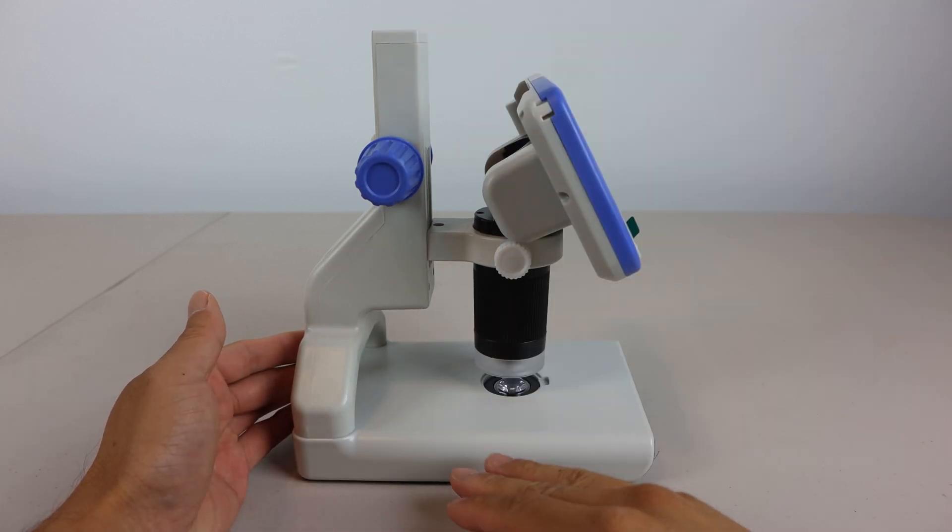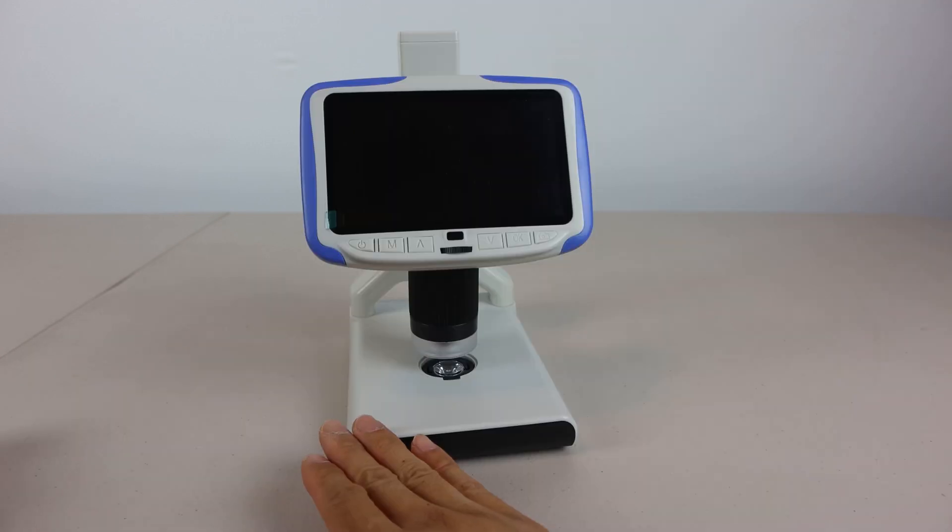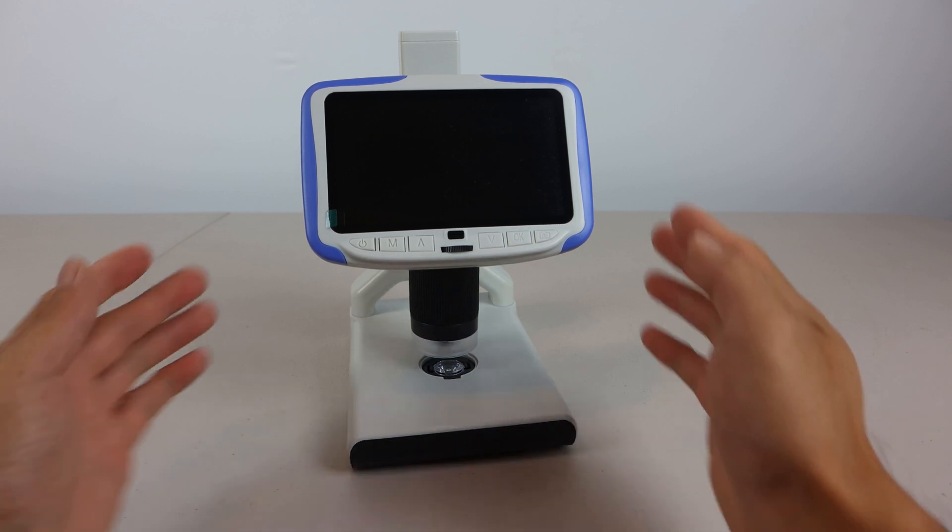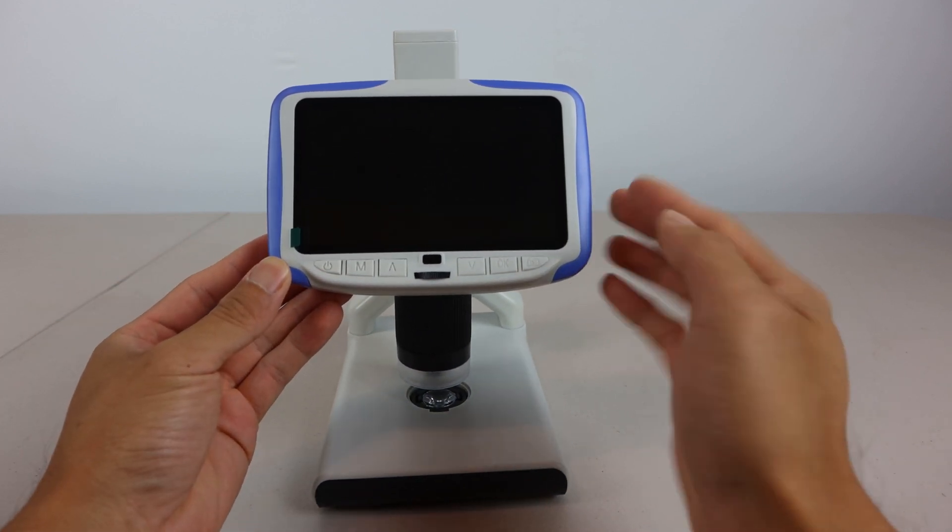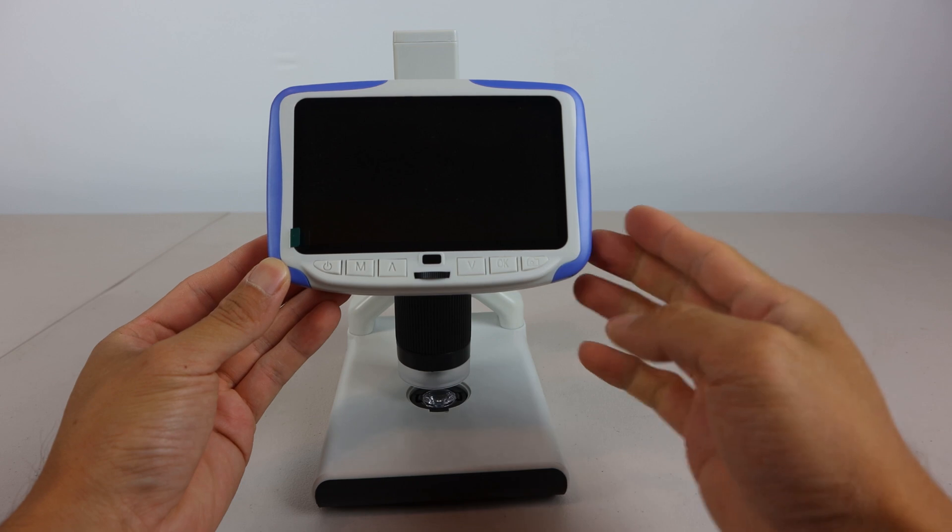This is the microscope. It is 8.5 inches tall, 7 inches long, and 4.5 inches wide. The construction is mostly lightweight plastic, and it has a 5 inch diagonal LCD.